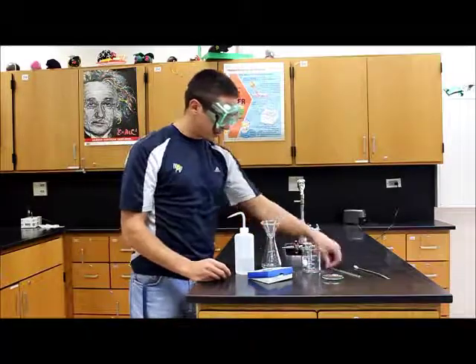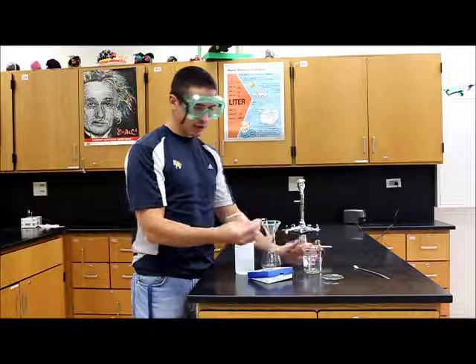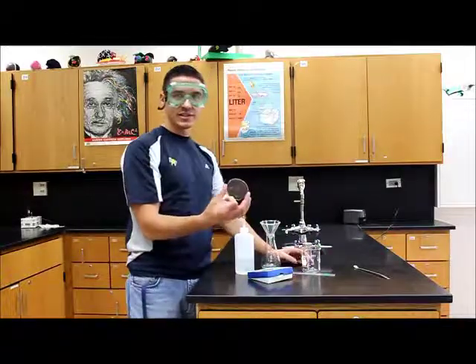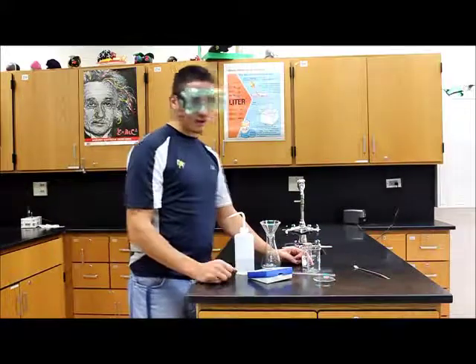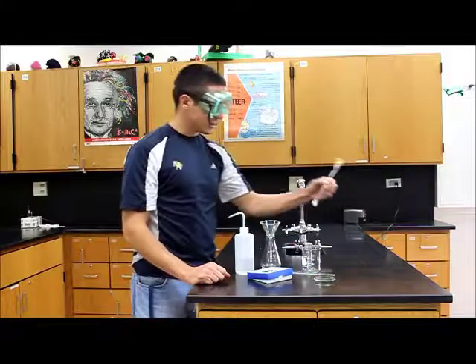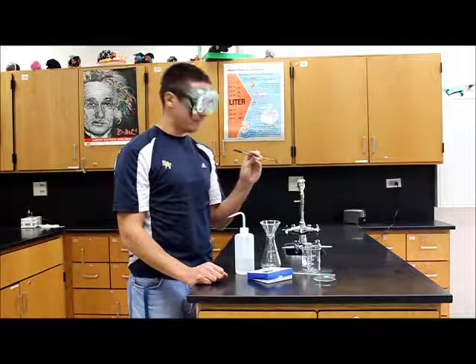You're actually going to be doing the mixing of the chemicals themselves in a 250 milliliter beaker. So you're going to want to make sure that's nice and clean. And you're going to use a stir rod to mix your 2 chemicals. You're going to use a watch glass instead of a weigh boat to measure these chemicals out with. So you're going to put that onto your electronic balance, zero your balance, and then put your chemicals onto here. You need filter paper, and then you're also going to need some kind of scoop for the actual lead 2 nitrate and the potassium iodide.